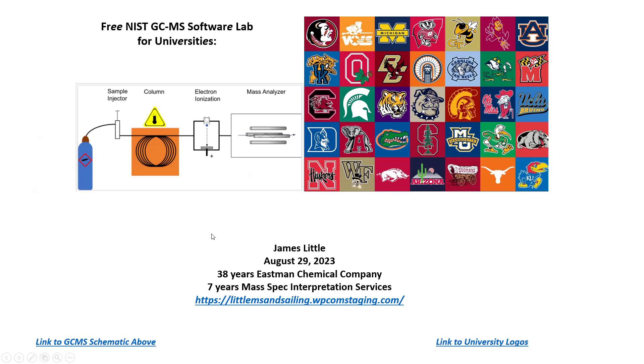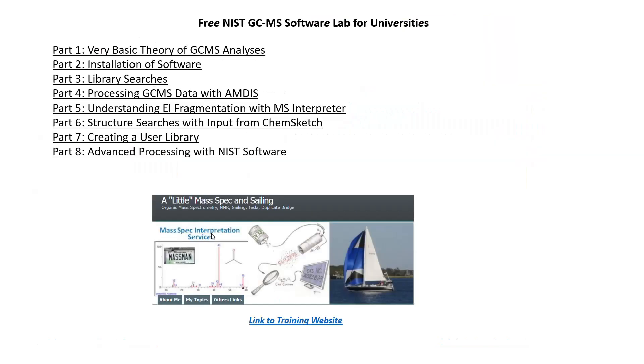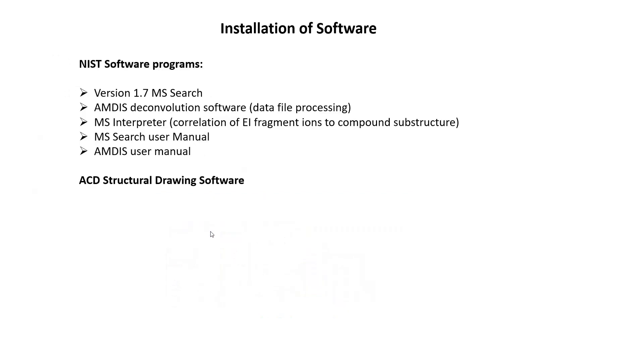Good afternoon. My name is James Little and I want to share with you a free NIST GCMS software lab that I've developed for universities. This is part two, which covers installation of the software. This is part of an eight-part series for the course, and we'll install the following group of programs.